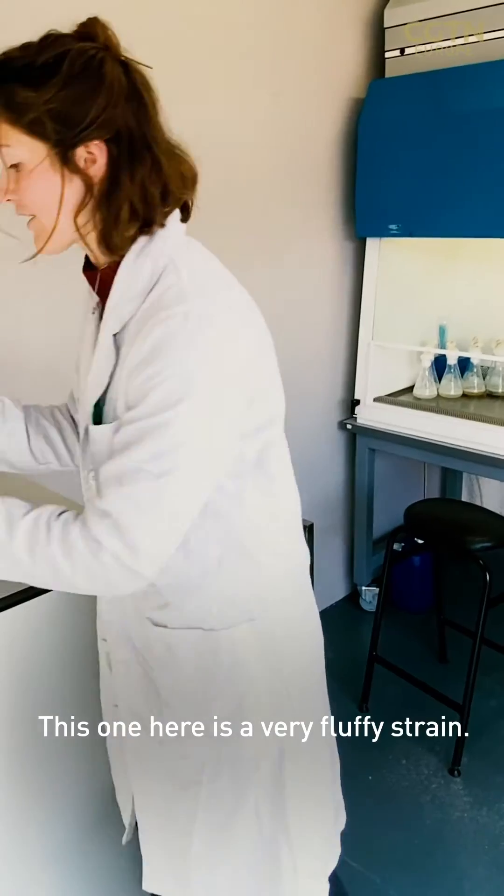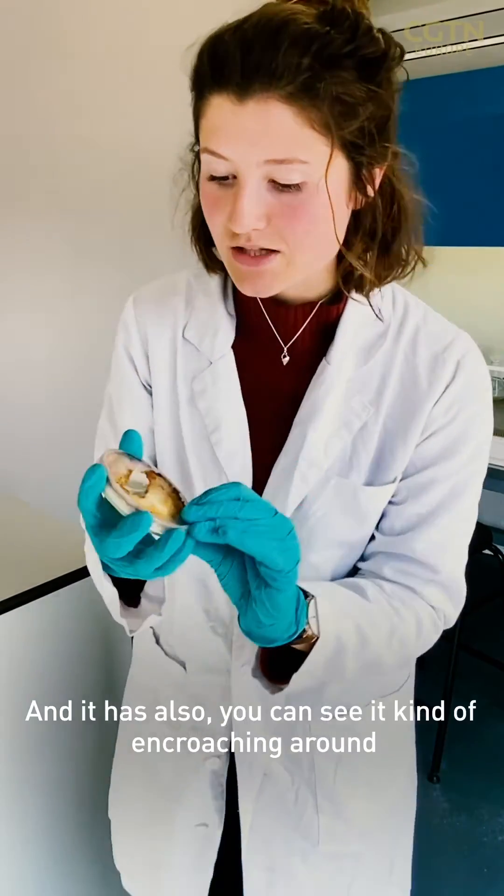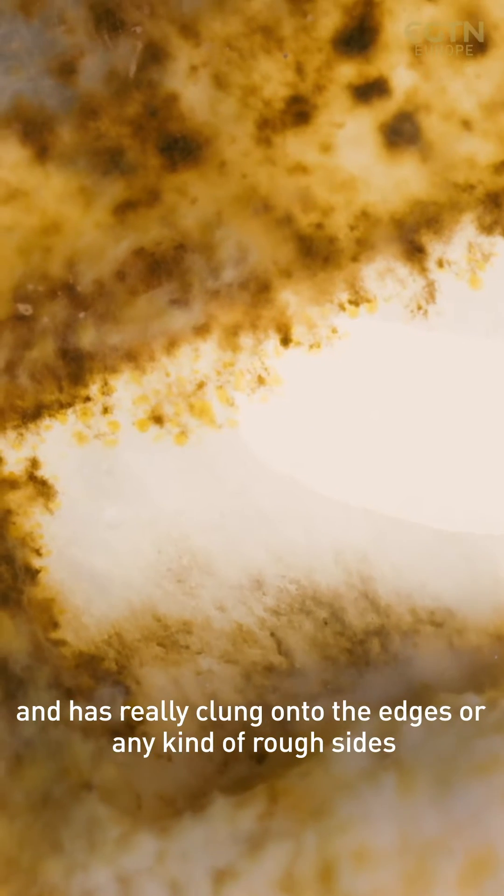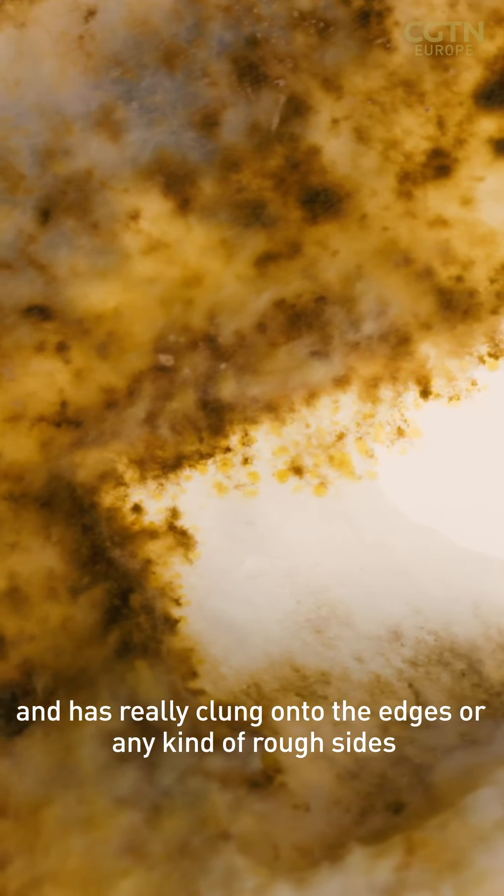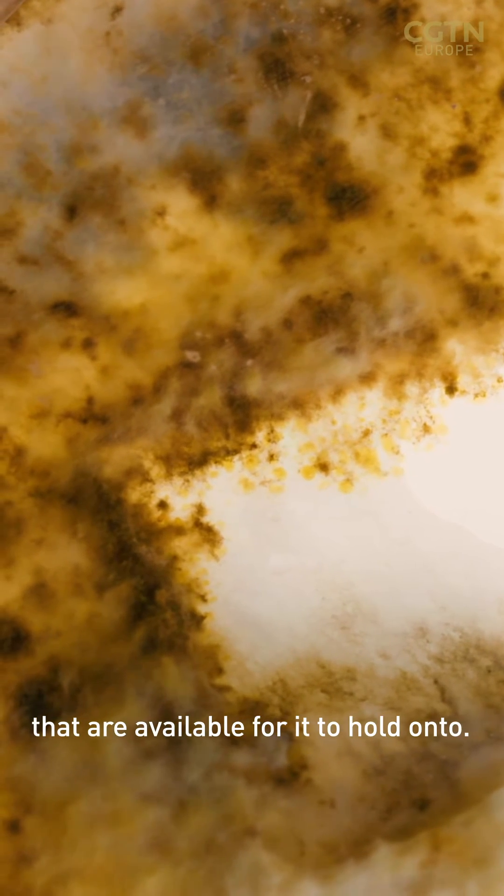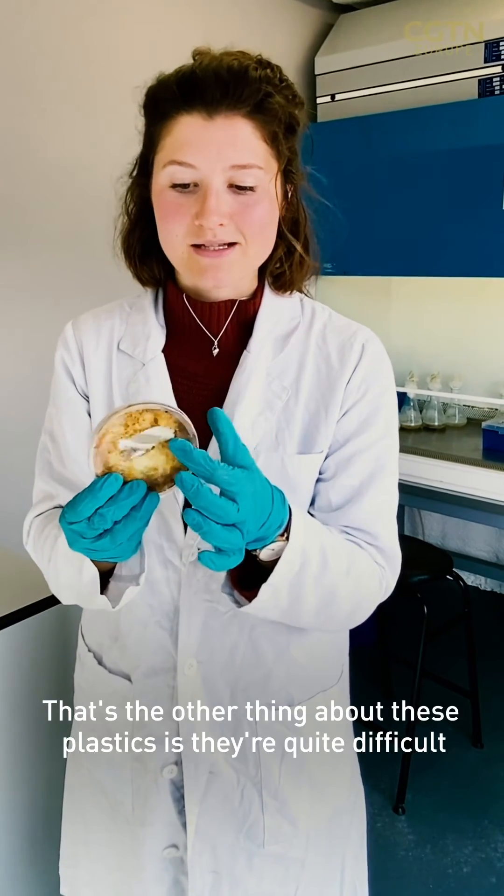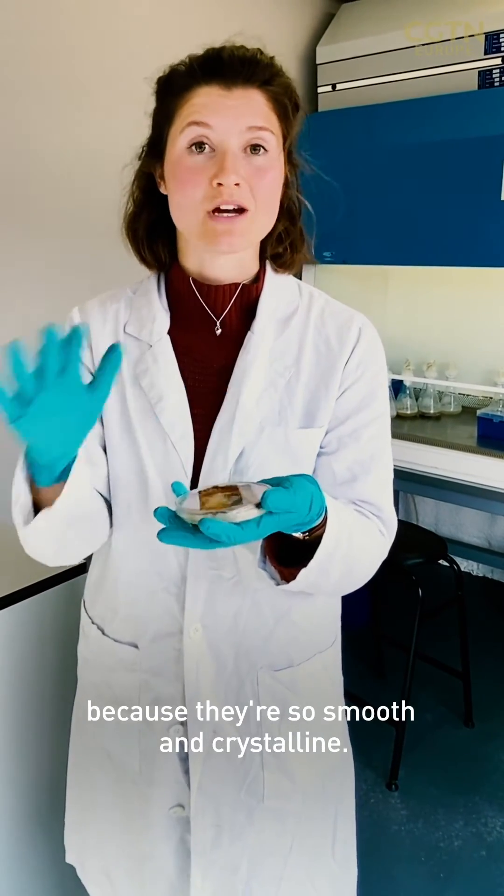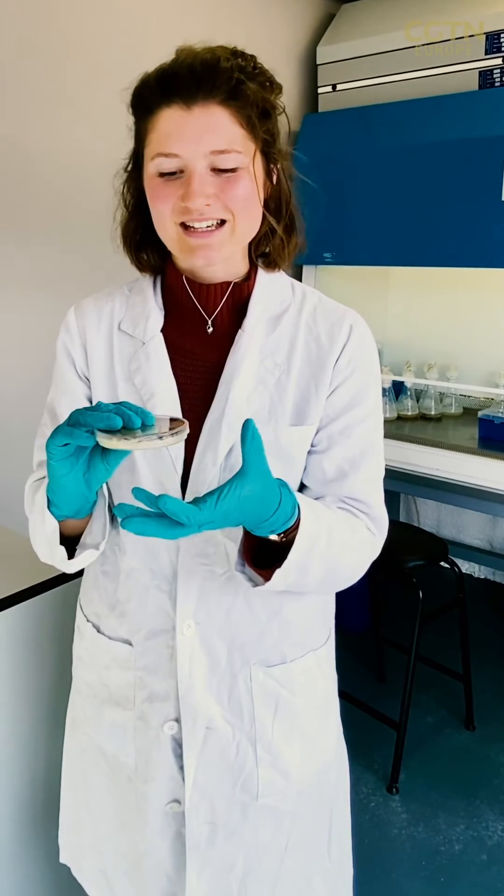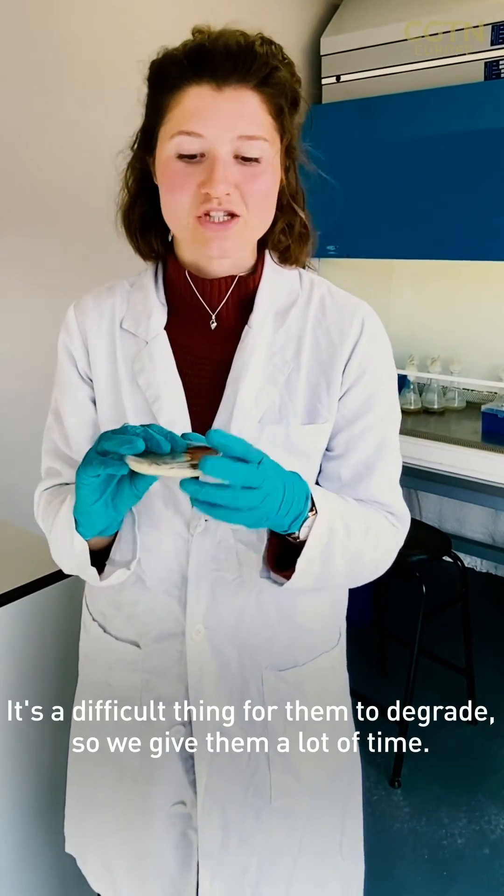This one here is a very fluffy strain and it has also, you can see it kind of encroaching around and has really clung onto the edges or any kind of rough sides that are available for it to hold on to. That's the other thing about these plastics is they're quite difficult for them to grab onto because they're so smooth and crystalline. It's a difficult thing for them to degrade, so we give them a lot of time.